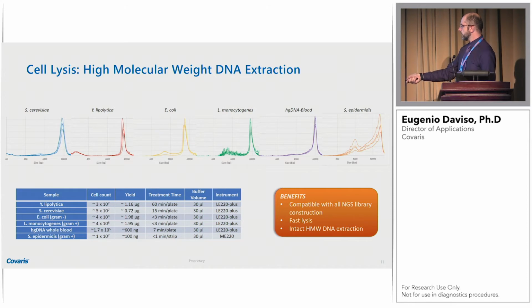This particular data was done on the LE220 Plus and also on the ME220, but like I mentioned before, the settings are easily transferable across all the instruments because the technology is the same.